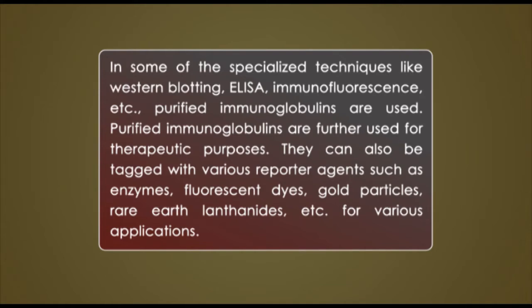Purified immunoglobulins are further used for therapeutic purposes. They can also be tagged with various reporter agents such as enzymes, fluorescent dyes, gold particles, rare earth lanthanides, etc. for various applications.